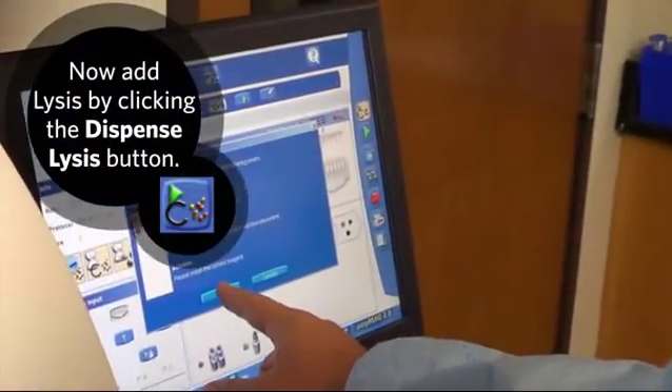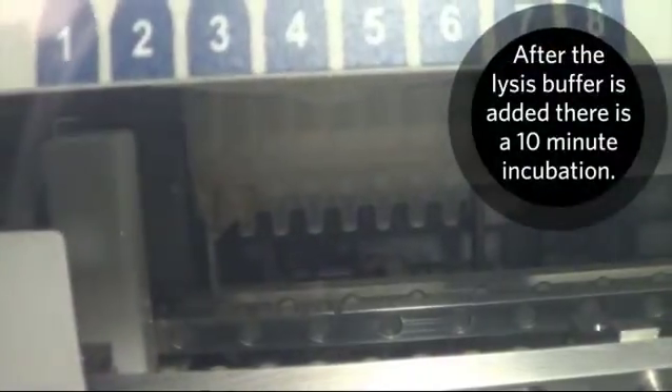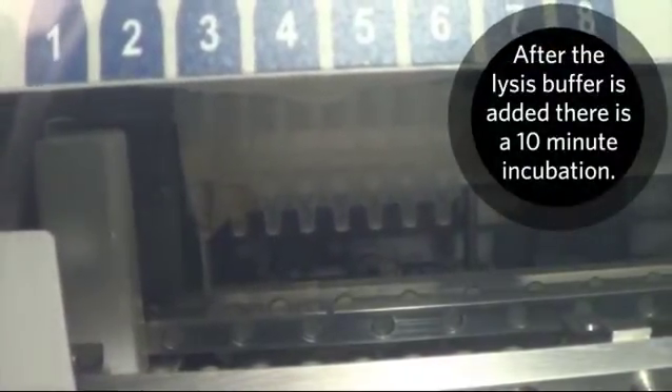Now add lysis by clicking the Dispense Lysis button. After the lysis buffer is added, there is a 10-minute incubation.